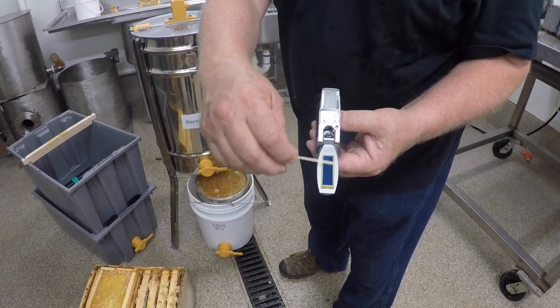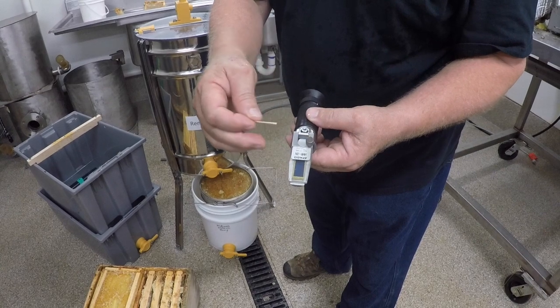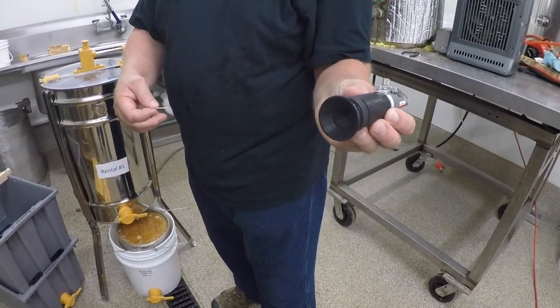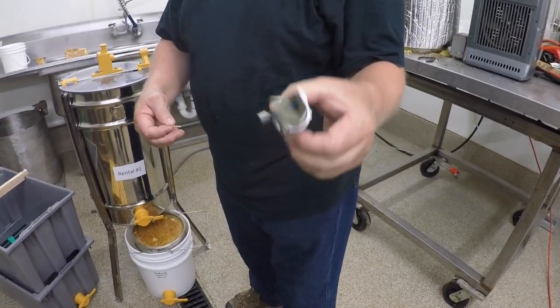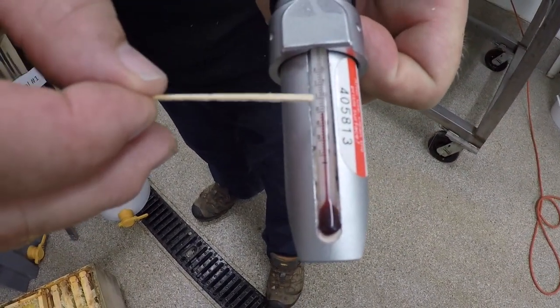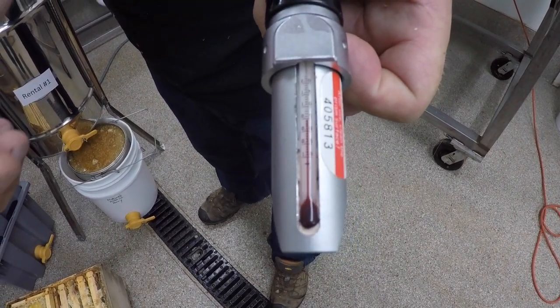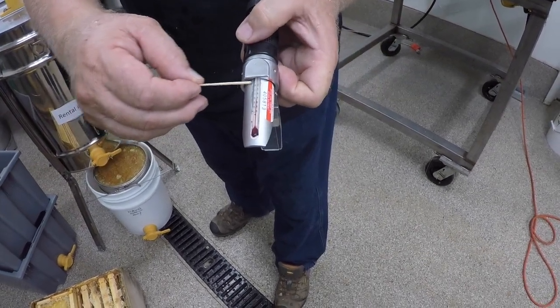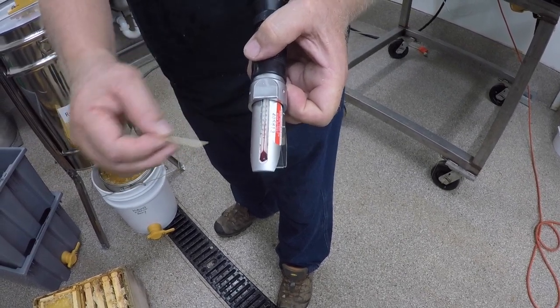on this lens. We're going to coat this lens with honey, and then we're going to close this. Then I'm going to look through the end, and there's a scale, and I'll be able to tell what the moisture content of the honey is. On the bottom of this, there is a thermometer, and the thermometer will give me a temperature adjustment for the moisture content. So on one side of the scale you add moisture content, on the other side of the scale you subtract. It depends on where the red thermometer is.